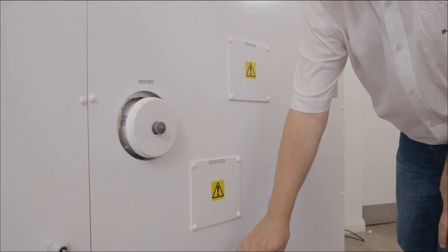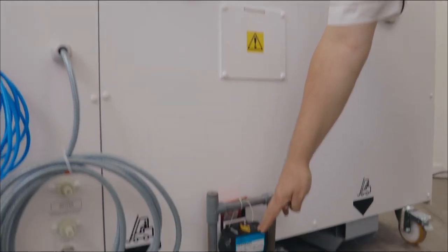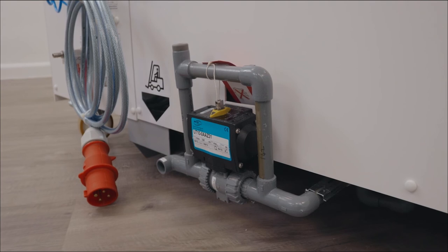Below these we have the automatic drain valve. This is pneumatically actuated and fully automatic.